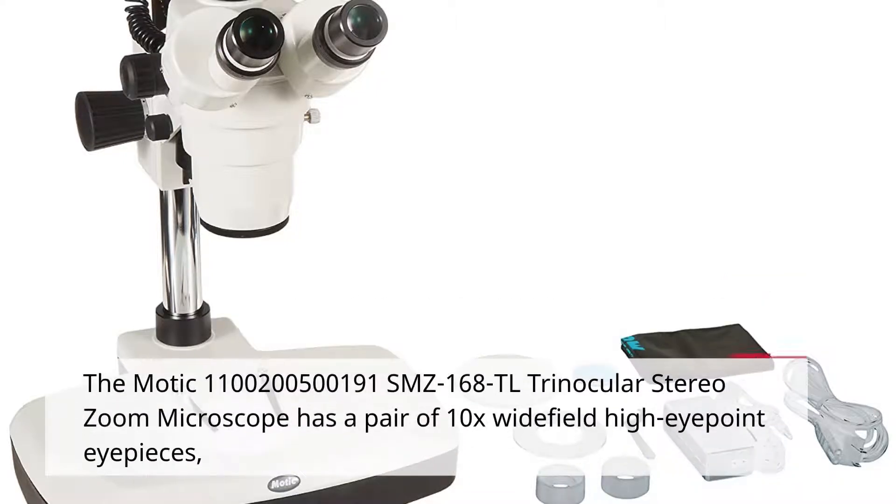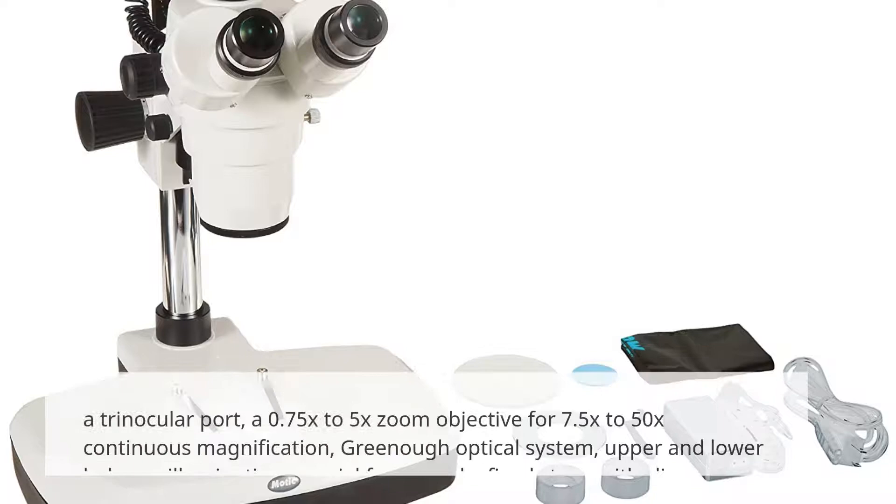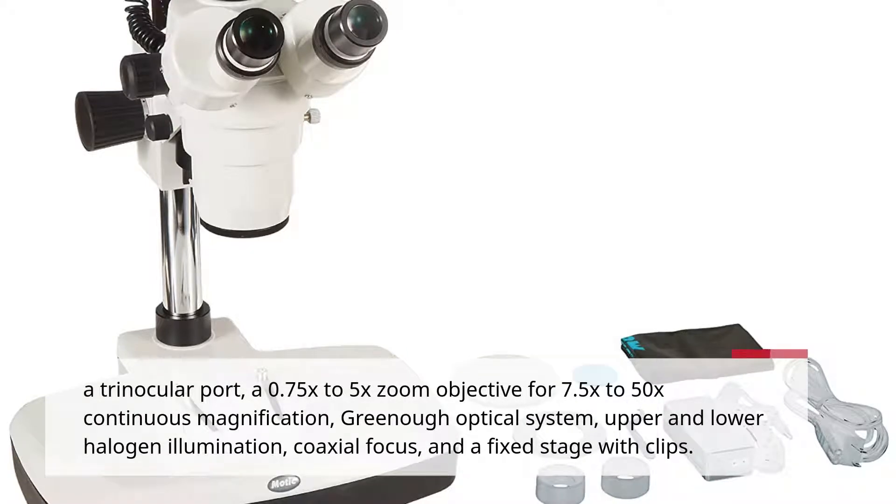The MOTIC SMZ-168-TL Trinocular Stereo Zoom Microscope has a pair of 10x Widefield High Eyepoint eyepieces, a Trinocular Port, a 0.75x to 5x zoom objective for 7.5x to 50x continuous magnification, Greenough Optical System, upper and lower halogen illumination, coaxial focus, and a fixed stage with clips.